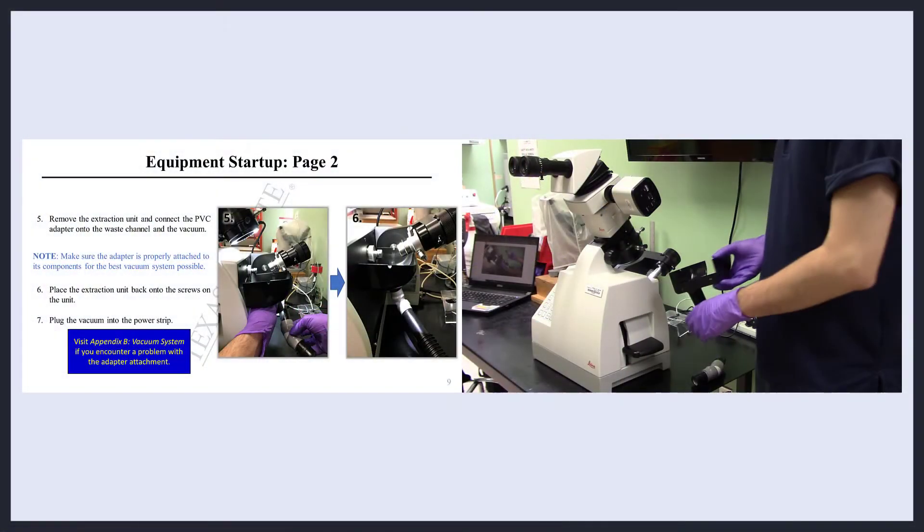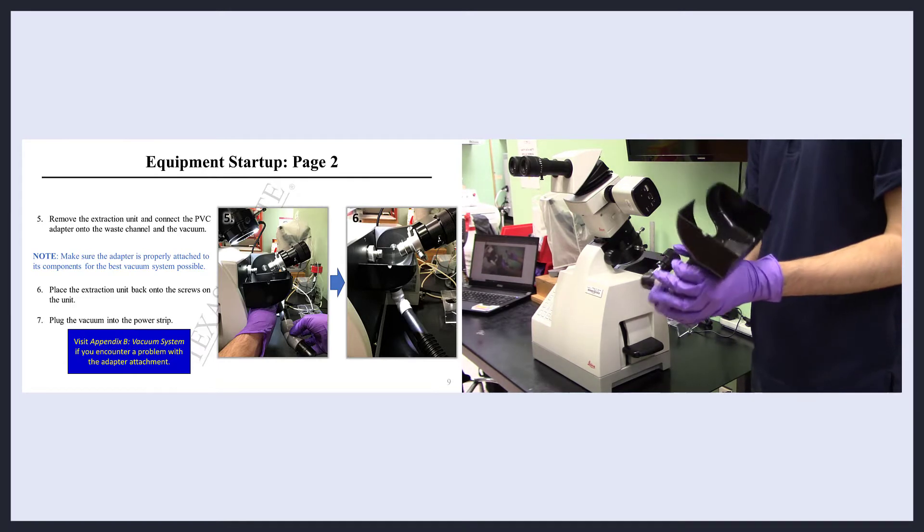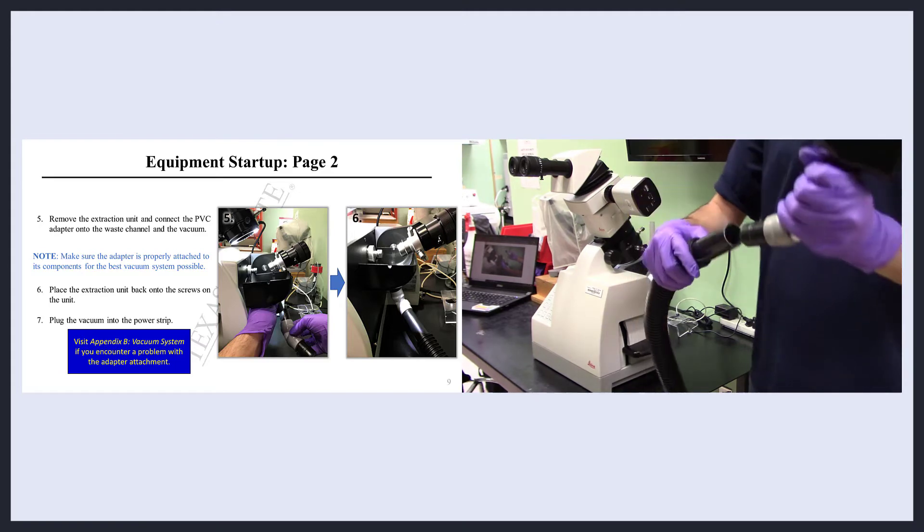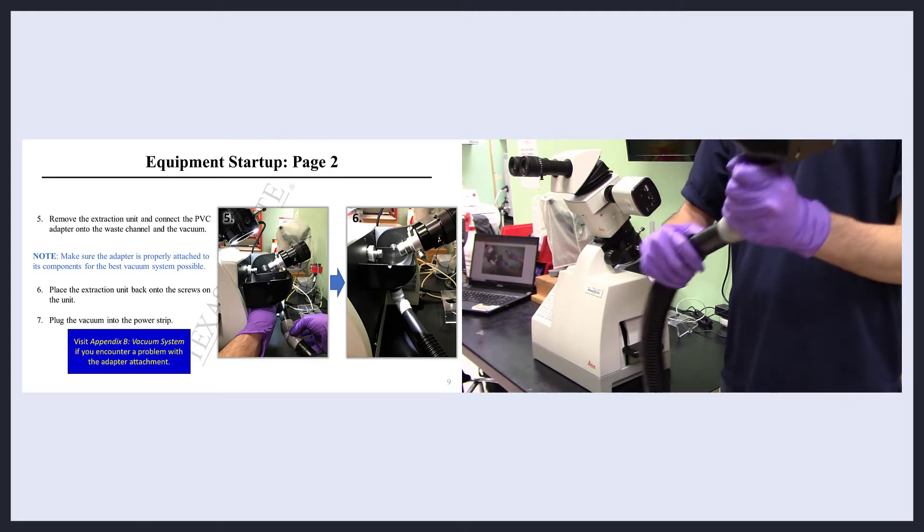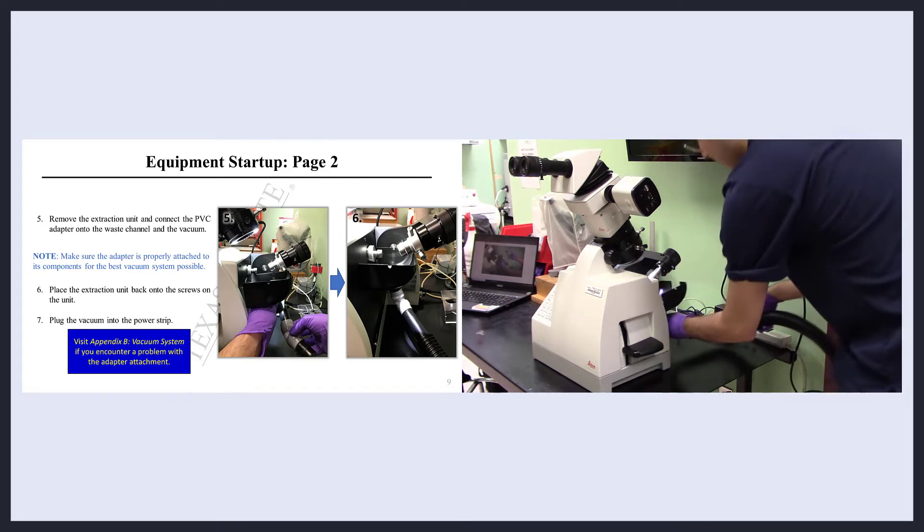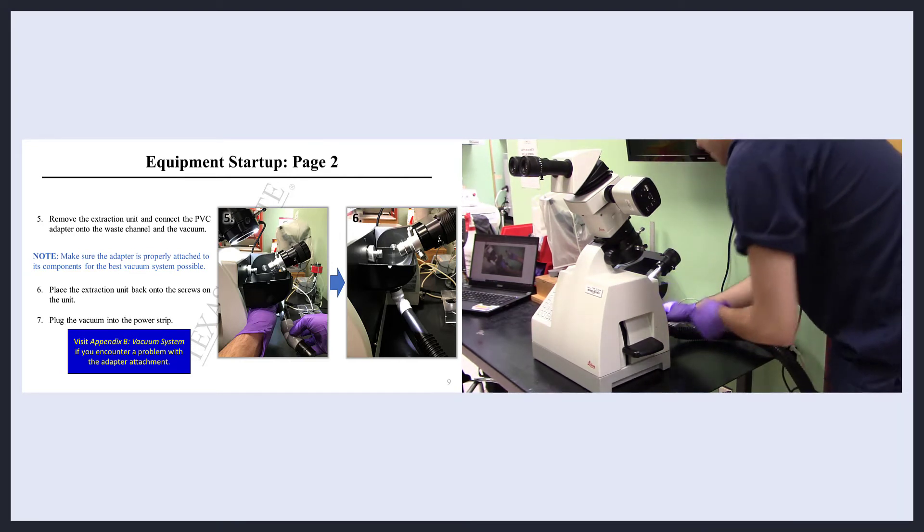To attach the vacuum system, remove the extraction unit and connect the PVC adapter into the waste channel of the extraction unit and the vacuum as shown. It is important to make sure the adapter is properly attached for the best vacuum system possible. Place the extraction unit back onto the screws on the unit and plug in the vacuum.